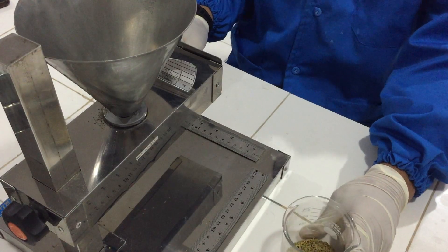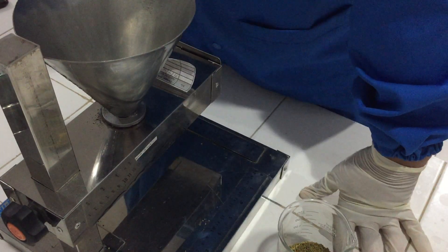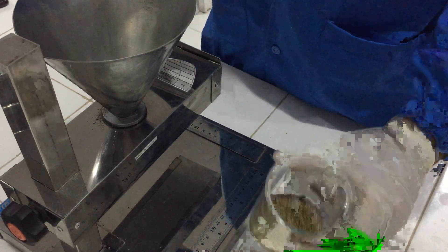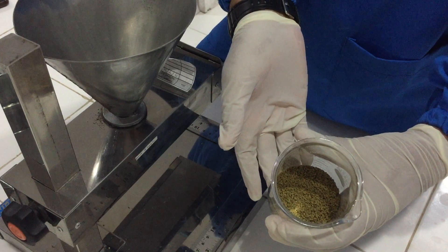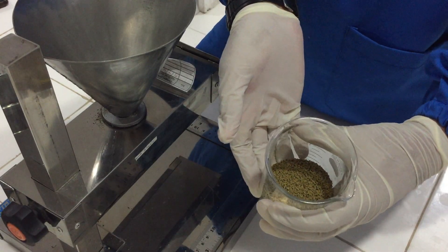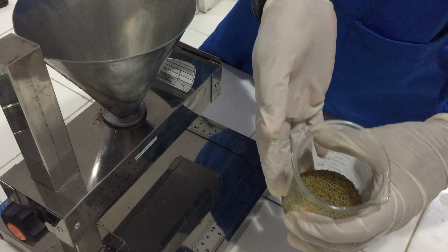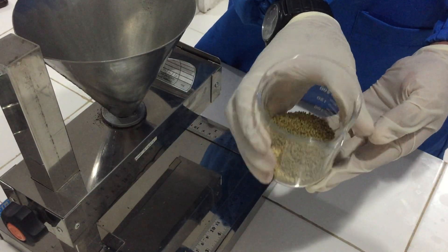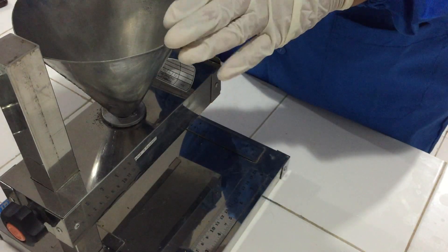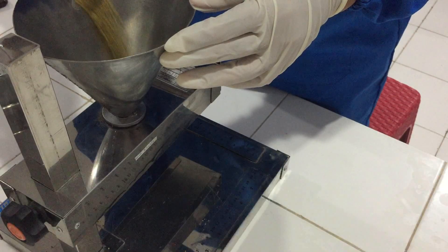Baik, untuk percobaan berikutnya adalah percobaan tentang sudut diam — evaluasi sudut diam pada granul. Granul yang kita gunakan adalah granul ekstrak etanol daun kelor, sebanyak 25 gram. Granulnya kita masukkan ke dalam alat sudut diam sebanyak 25 gram. (For the next experiment, we evaluate the angle of repose using 25g of moringa leaf ethanol extract granules, placed into the angle of repose device.)